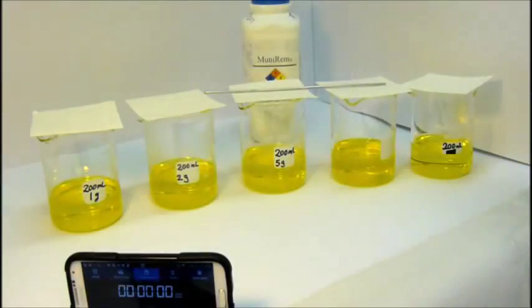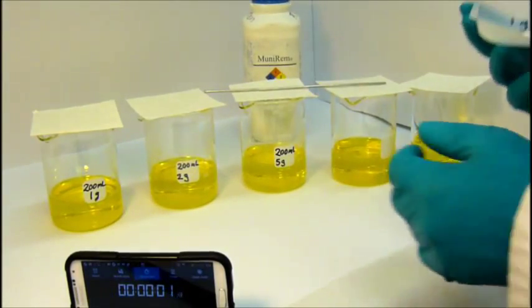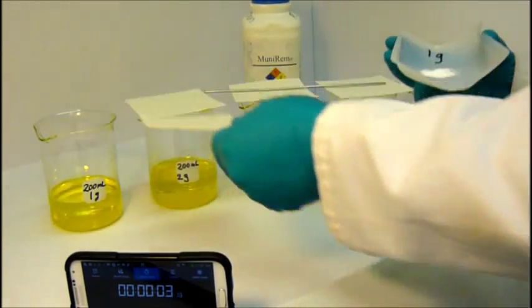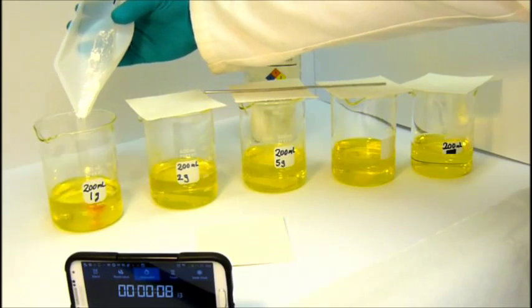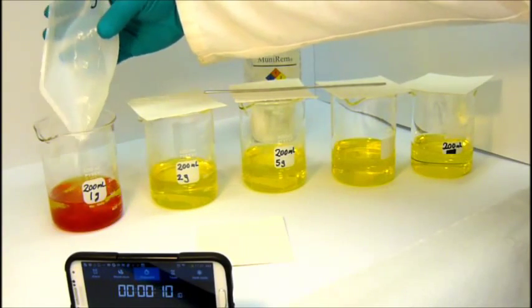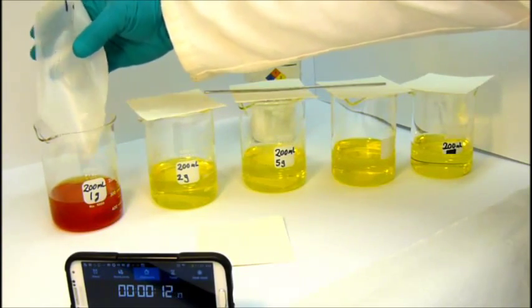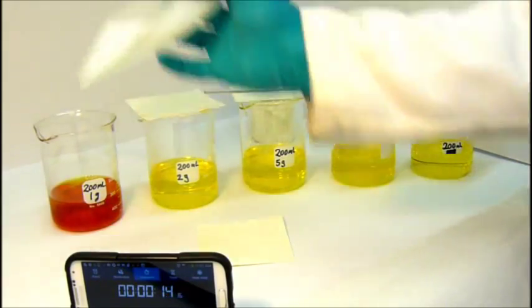To the first three beakers, we add one gram, two grams, and five grams of Munarem powder. The color change to dark red and then dark magenta shows that the picrate has been immediately and completely neutralized.